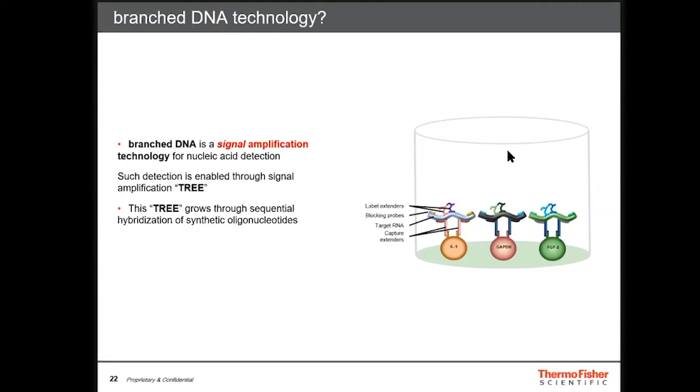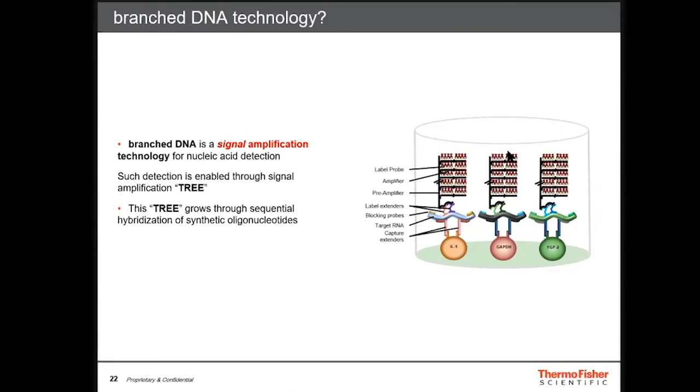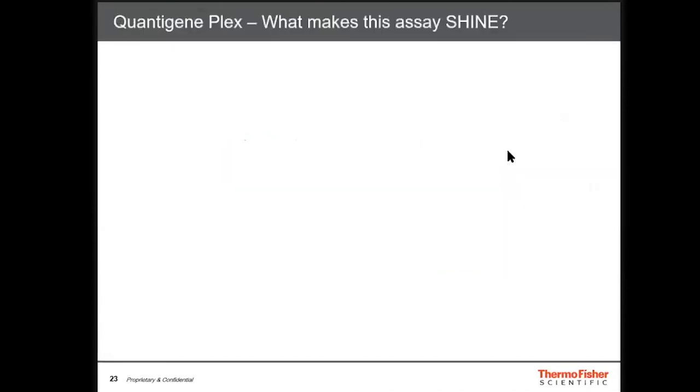So we got up to here with an overnight incubation, and then we start washing the beads. I'll talk about how that's done in a moment. And we have basically the same type of amplification reagents with the preamplifier, the amplifier. Here's where the assay diverts a little bit. The label probe in this assay is an oligo complementary to the branches with a biotin on it. And that biotin provides a binding site for streptavidin and phycoerythrin. The Luminex green laser is always looking at fluorescence from phycoerythrin. So that's how we incorporate it into the complex, and subsequently read on the instrument.